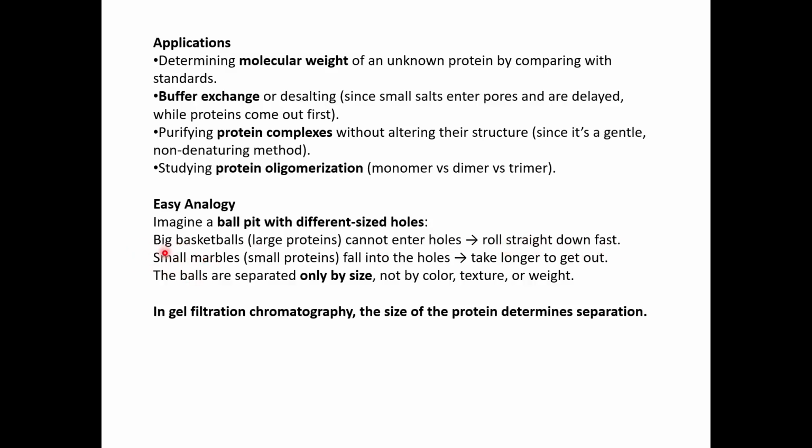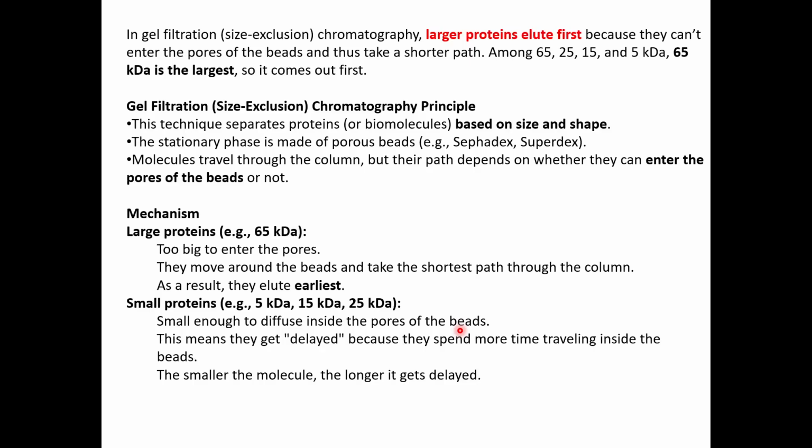But small balls like marbles are smaller proteins, so these marbles will fall into the holes and will take a longer time to get out. So the balls are separated only by size, not by color, not by texture, not by weight, nothing, solely size. So in case of gel filtration chromatography, the size of the protein is the one factor that determines the separation.